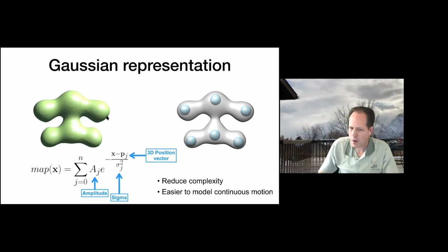Okay, so we can try and represent this multi-enzyme complex with anything ranging from 6 Gaussians to 1,000 Gaussians, right? It just depends on the level of detail we want. But even with 6 Gaussians, we could characterize the overall motion of the system, and that would give us enough information for classification of individual particles. So if we understood the 3-dimensional motion of the system in terms of even these 6 Gaussians, we could then use that to classify the particles and produce higher resolution averages of particles which were in a similar 3D conformation based only on their 2D appearance. So that's where we're trying to get with this whole approach.